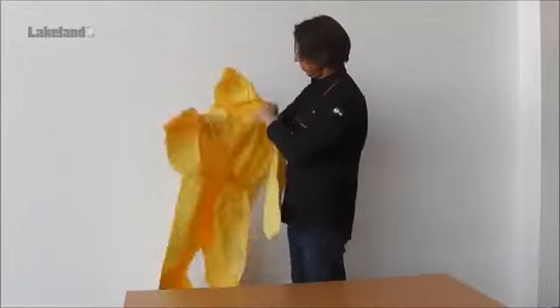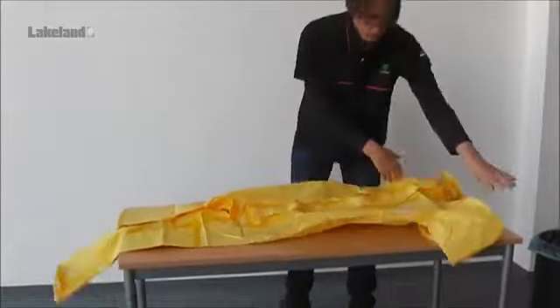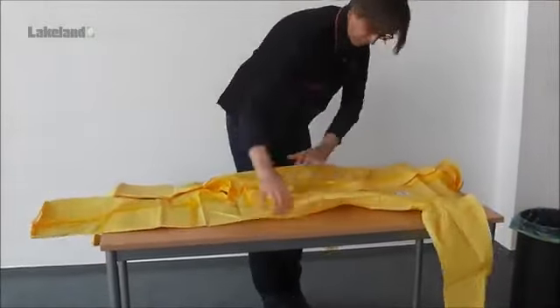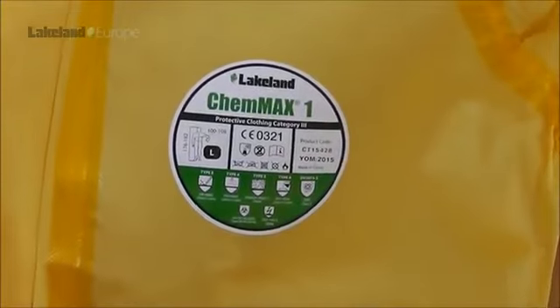Examine the garment to ensure no damage has been suffered during transit or storage. Where possible, lay it on a smooth flat surface such as a table top for further examination and to open the front fastening. Do not use a rough surface or a surface with any sharp edges as this could damage the suit.